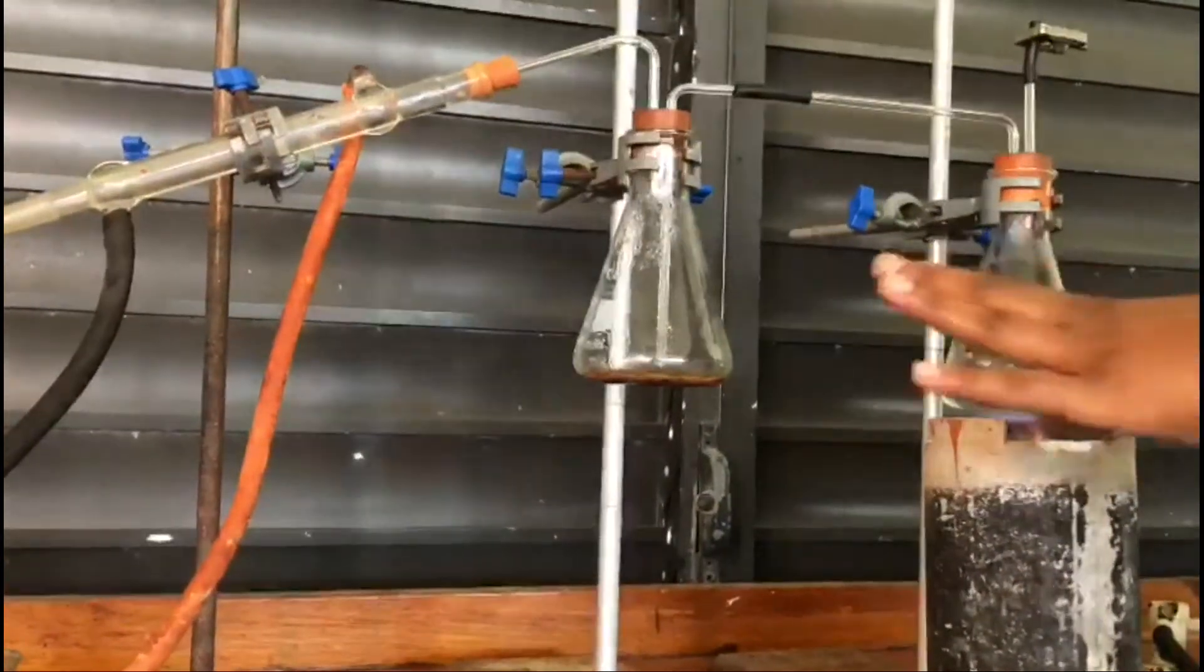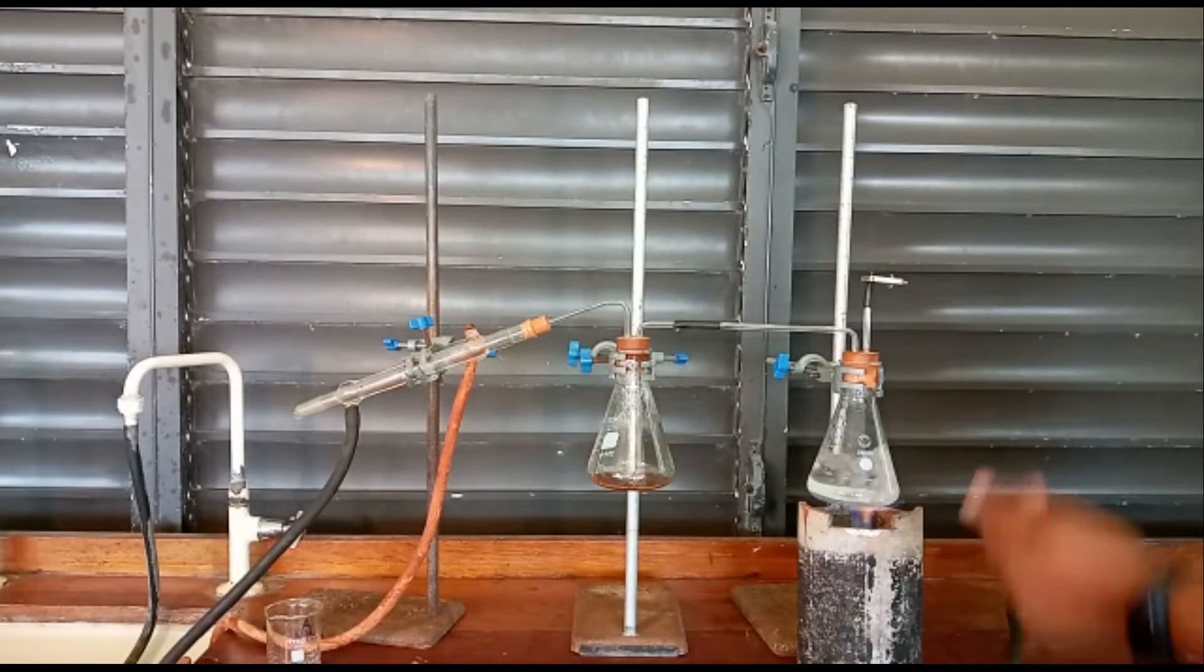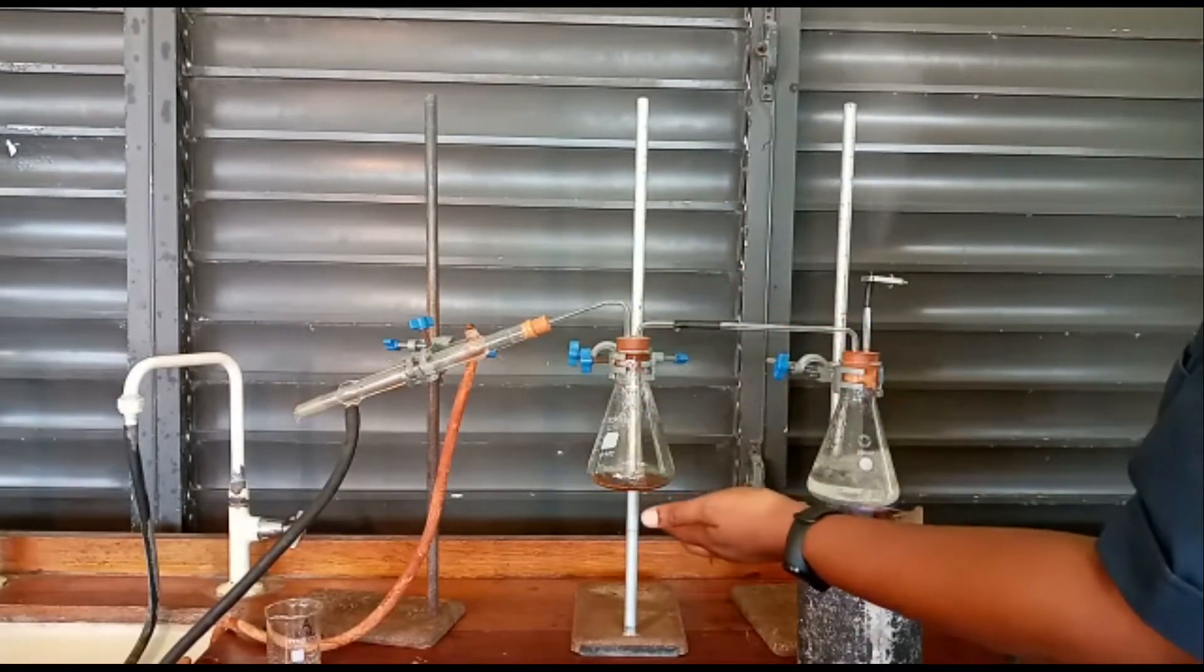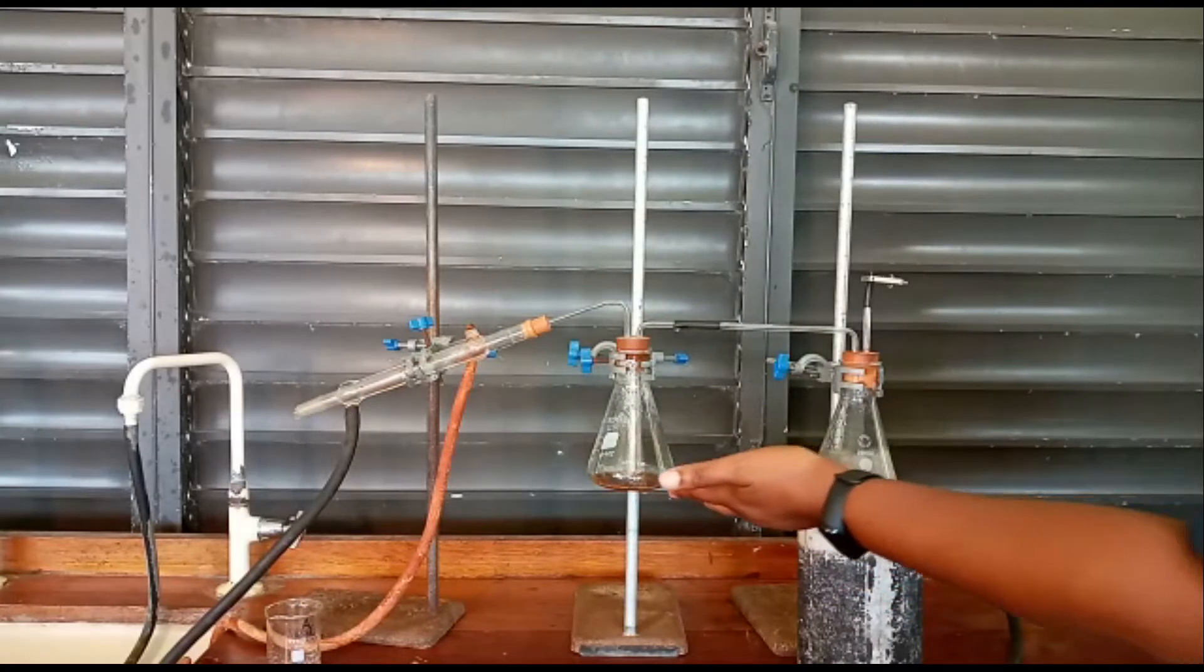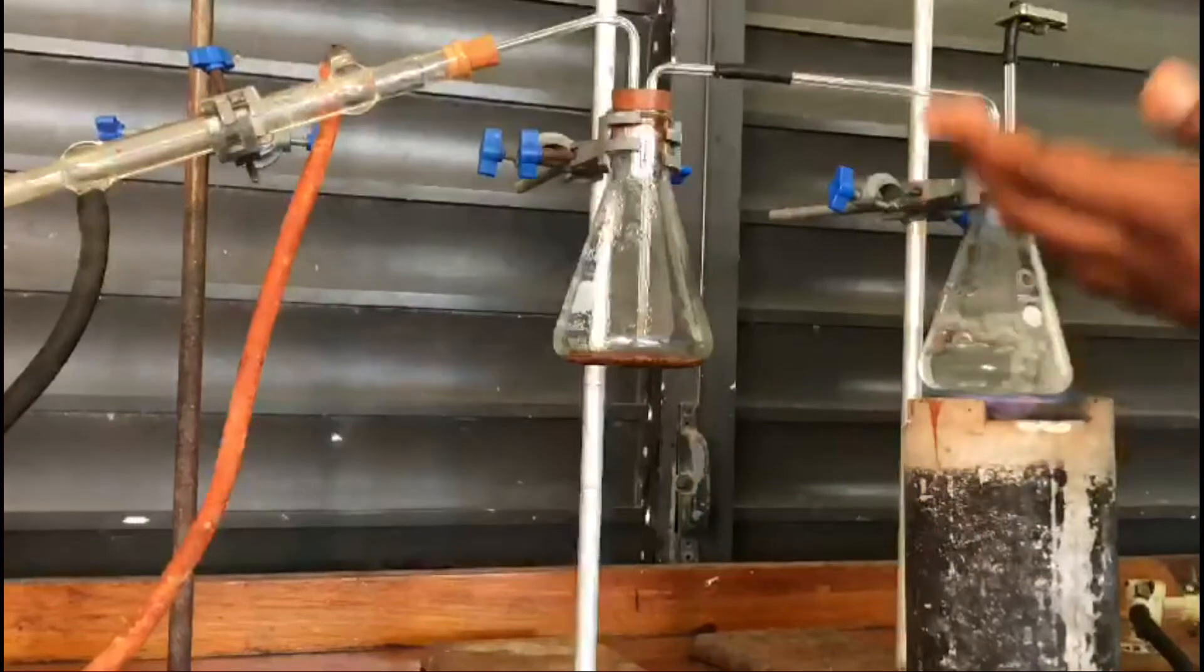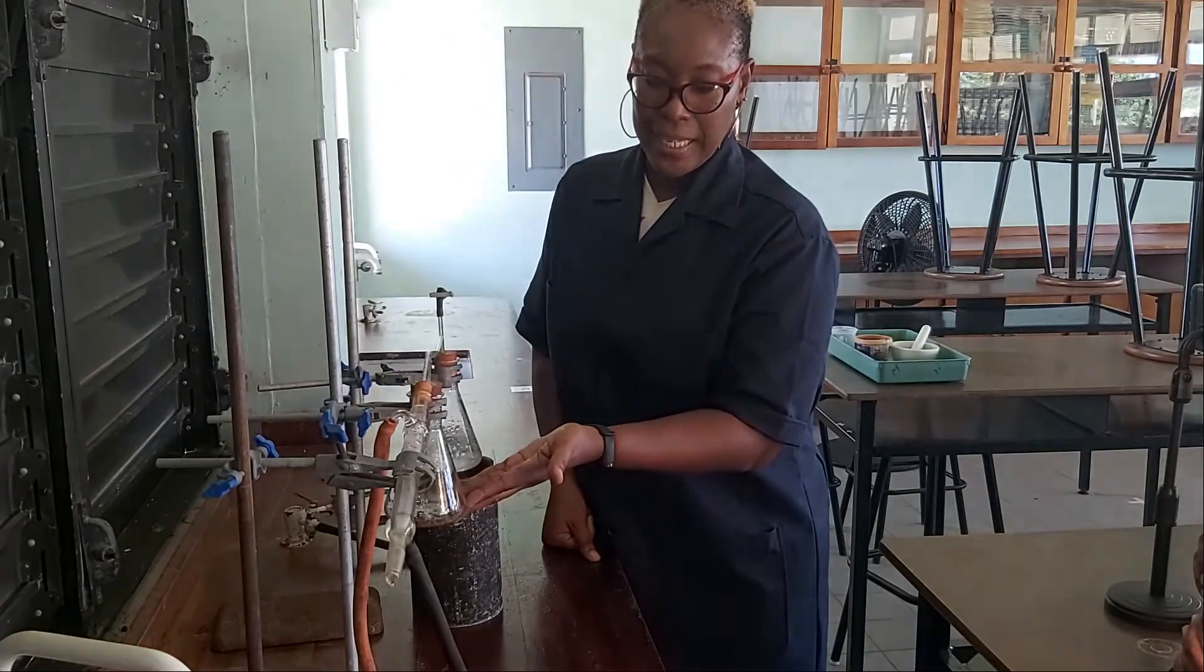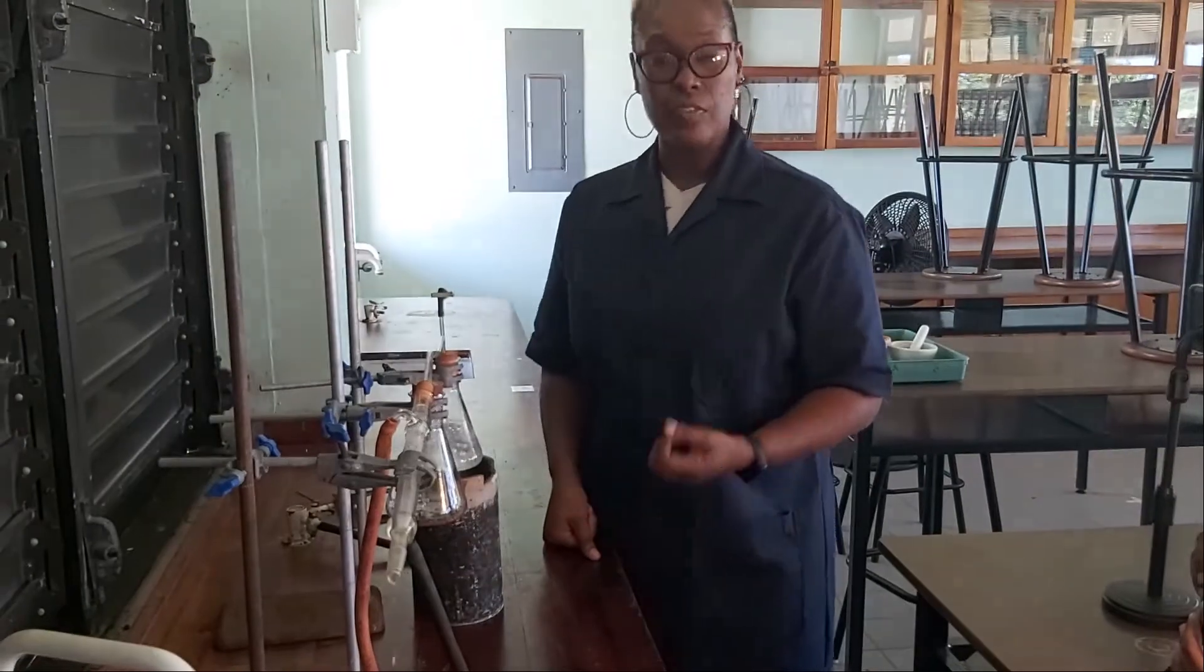Note also that we're having some bubbling in here. As vapors are delivered into this mixture of clove powder and colorless liquid—which you can probably identify by now—this bubbling is serving two functions.